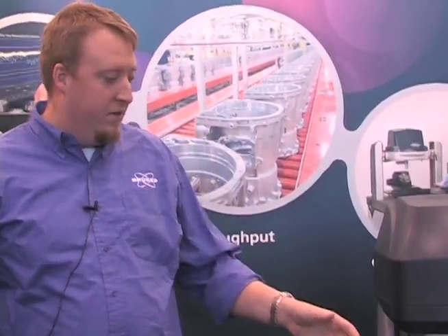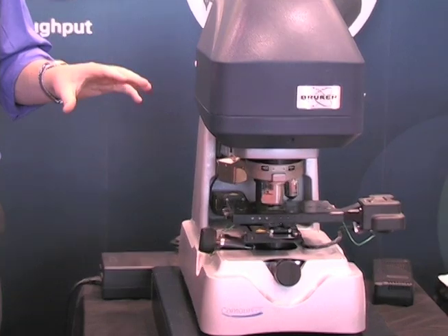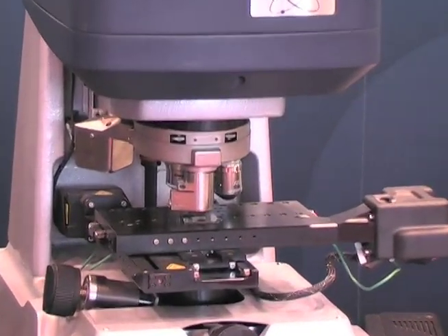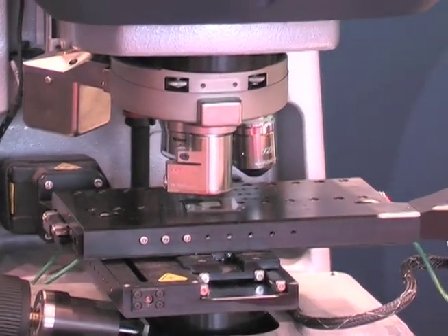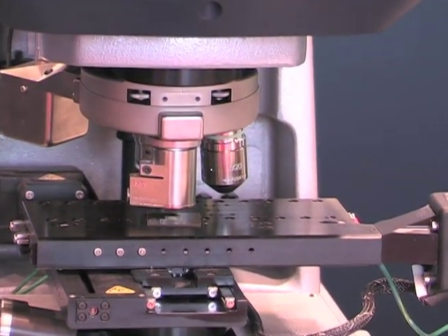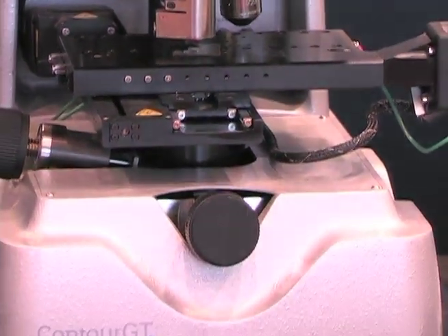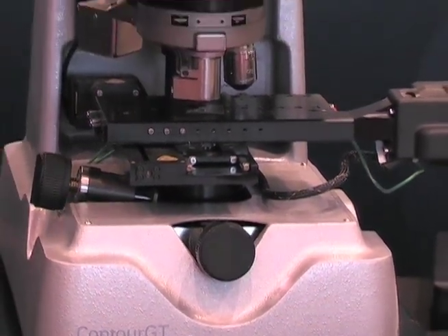What we have here today is a Bruker Contour GTK1 scanning white light interferometer. It works essentially like a regular microscope except we use the interferometric procedure to scan the surface and actually generate a 3D surface map to characterize roughness, surface finish, texture, and we work across a variety of industries to measure and characterize these parts.